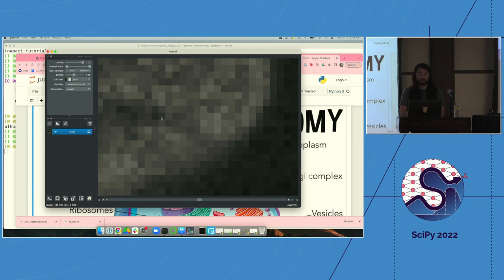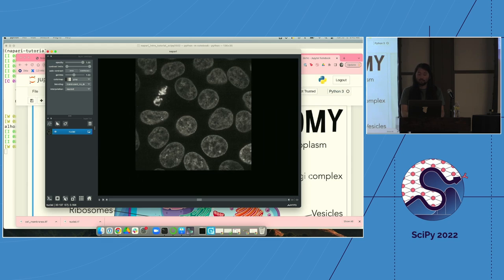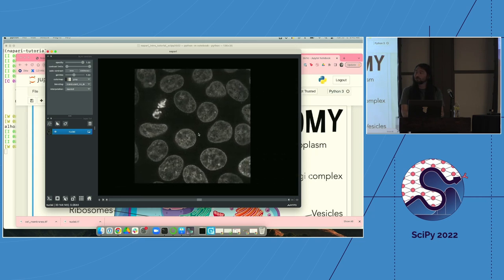The value generally tells us how bright the image is, or how much of the quantity we're measuring exists at that position. In this case, it's an image of nuclei and cells — it tells us roughly how much DNA is in that location. Since this is a three-dimensional image but we're viewing in 2D, Napari creates a slider at the bottom to slice through the z-axis. For example, at slice 30, moving right brings us to slice 37.